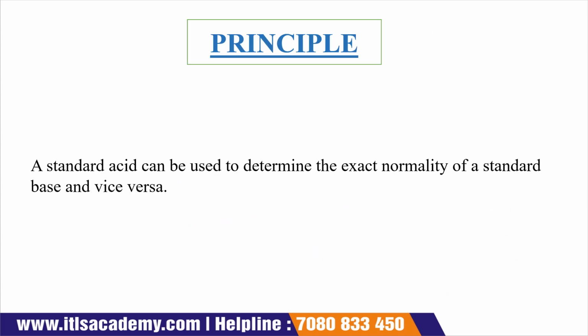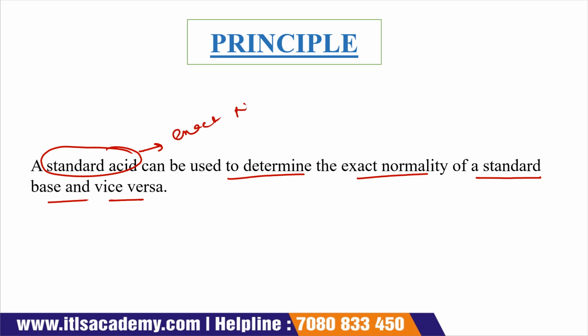Now the principle: a standard acid can be used to determine the exact normality of a standard base and vice versa. That means if we use a standard acid, with the help of this standard acid, we find out the exact normality of a standard base.